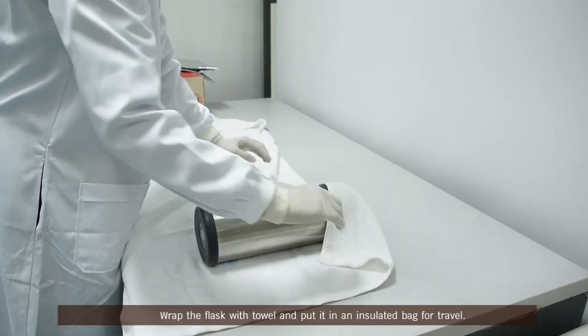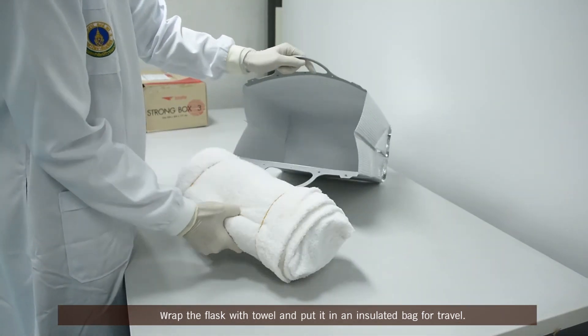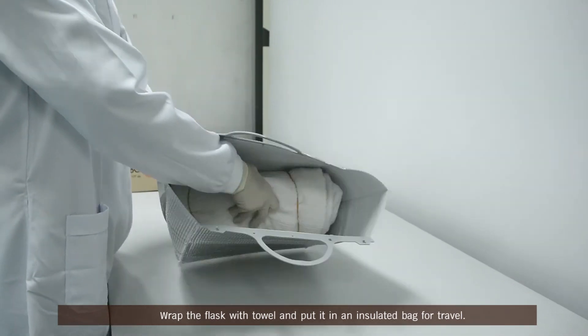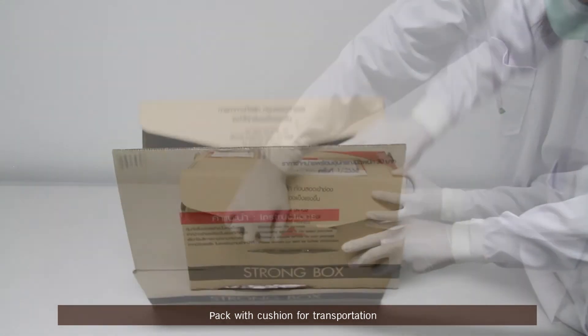Wrap the flask with a towel and put it in an insulated bag for travel. Pack with cushion for transportation.